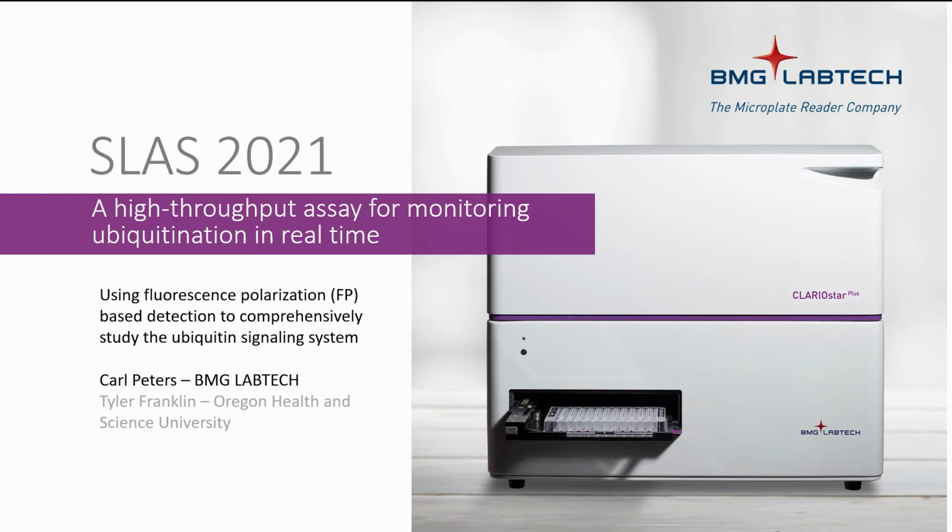Today's tutorial will feature the work of Tyler Franklin from OHSU. Tyler has developed a fluorescence polarization assay using a CLARIOstar that has allowed them to study the ubiquitin signaling system.